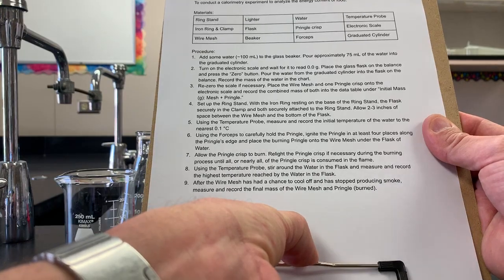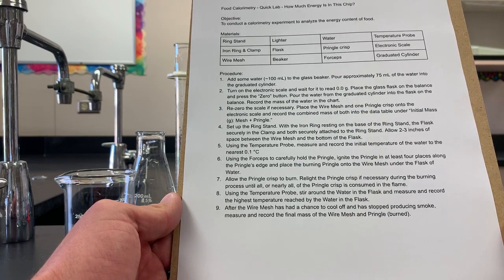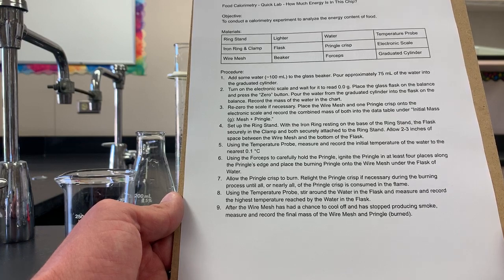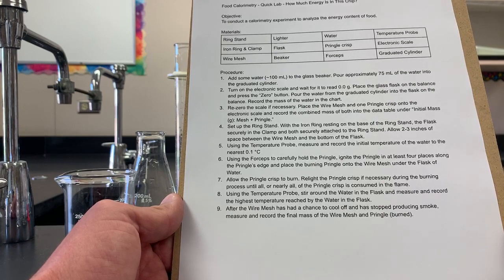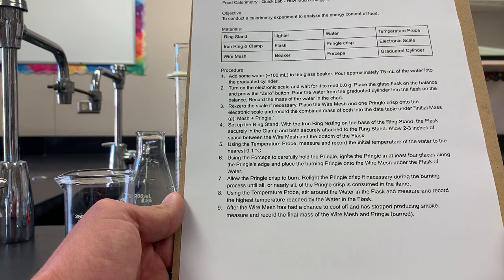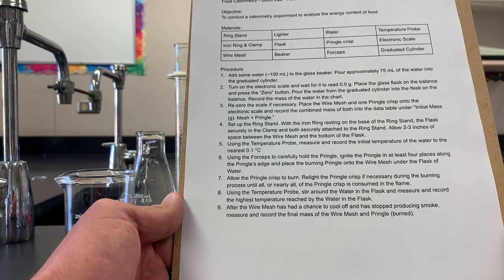Step four: set up the ring stand with the iron ring resting on the base of the ring stand, the flask securely in the clamp and both securely attached to the ring stand, allowing two to three inches of space between the wire mesh and the bottom of the flask. Step five: using the temperature probe, measure and record the initial temperature of the water to the nearest 0.1 degrees Celsius. Step six: using the forceps to carefully hold the Pringle, ignite the Pringle in at least four places along the Pringle's edge and place the burning Pringle onto the wire mesh under the flask of water. Step seven: allow the Pringle crisp to burn. Relight the Pringle crisp if necessary during the burning process until all or nearly all of the Pringle crisp is consumed in the flame.